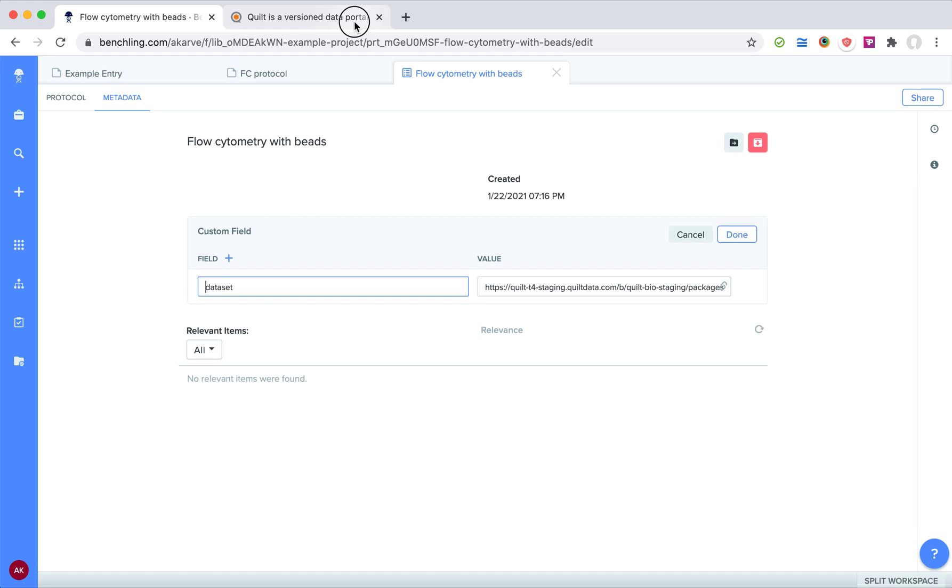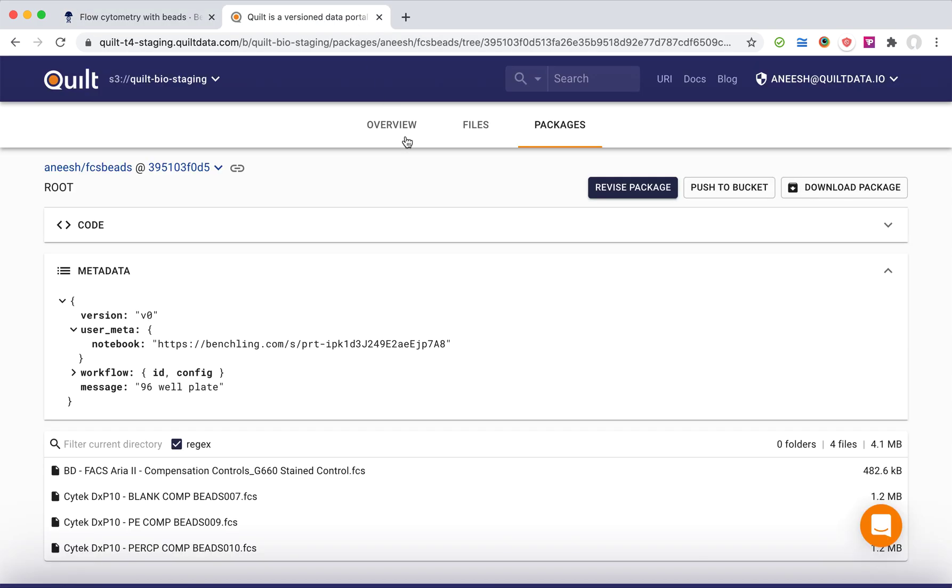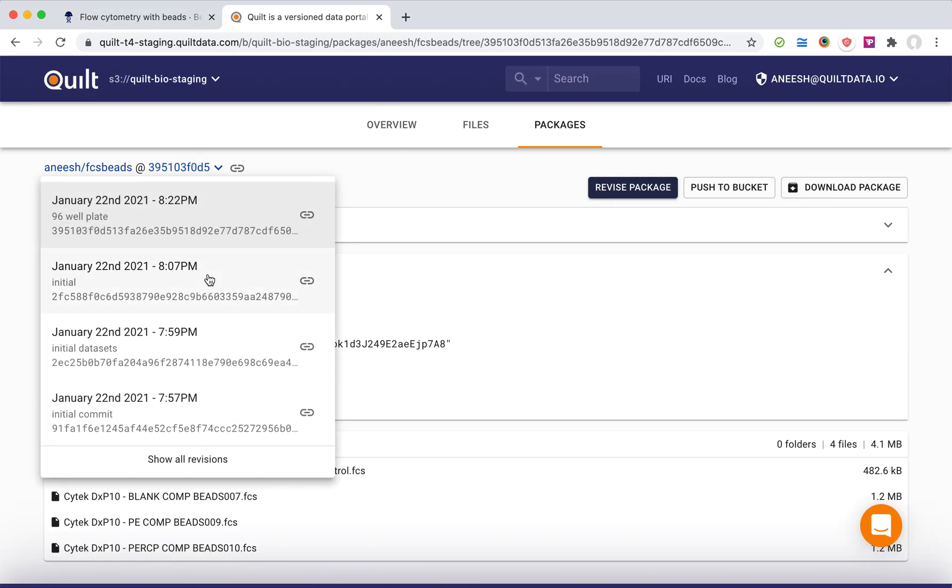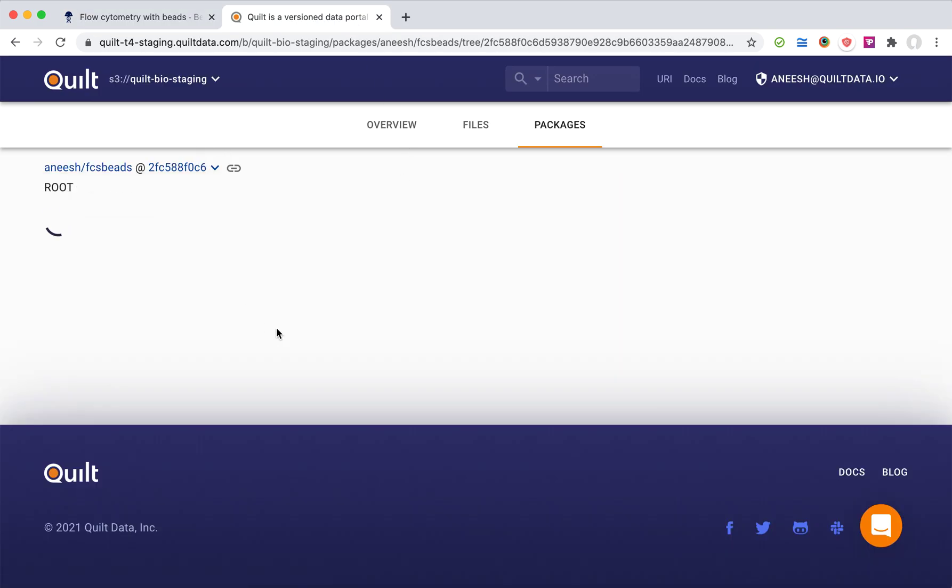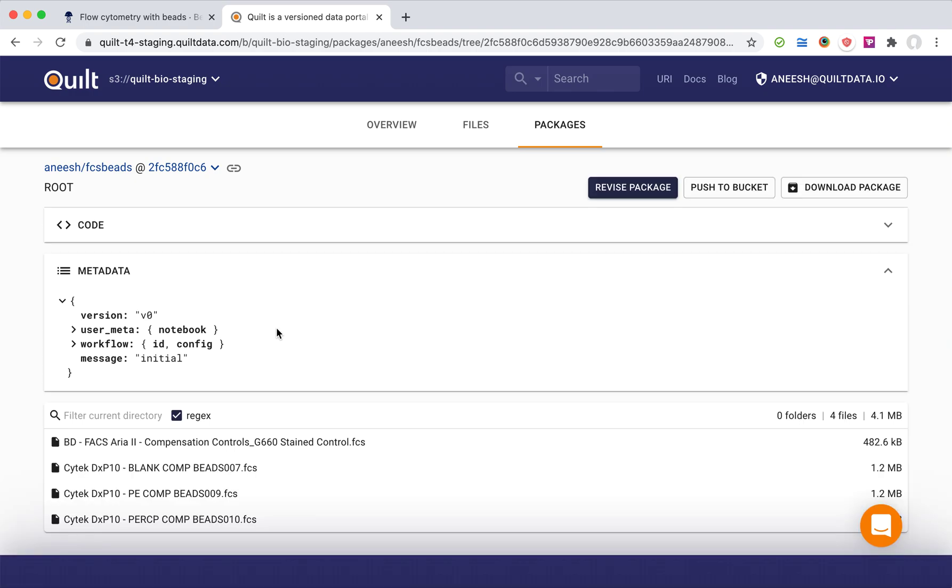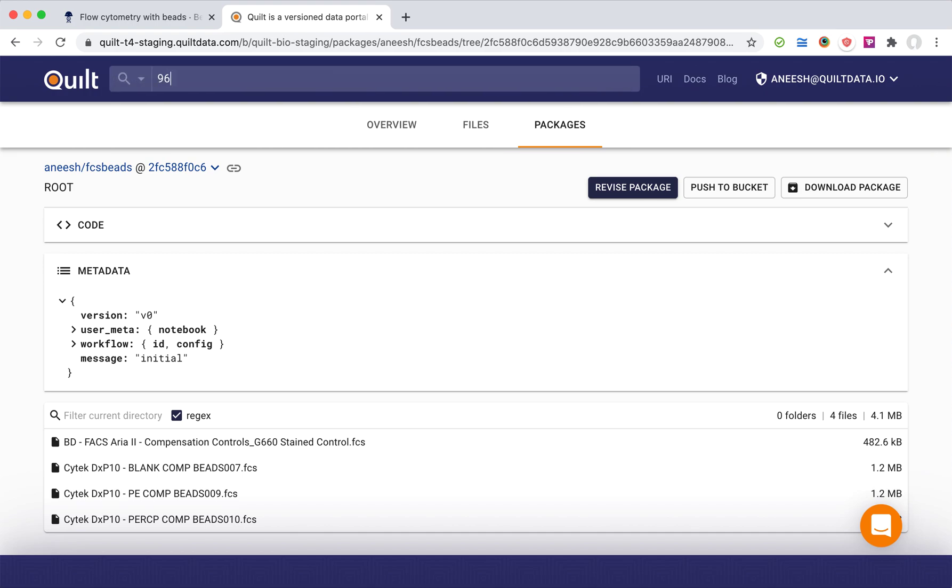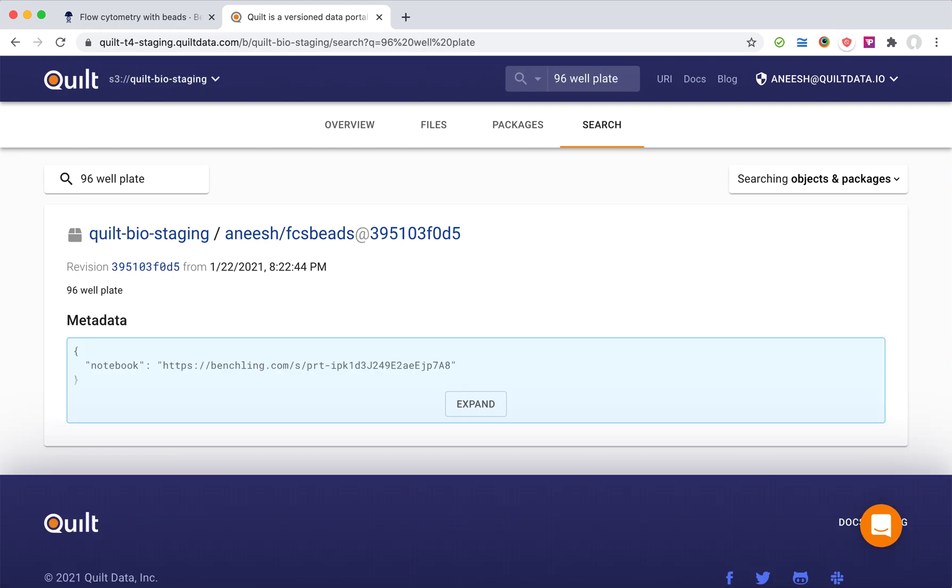Each of these revisions is a complete time capsule, so the data is what we call immutable—it can never change. Any colleague who wants to grab this data can first of all find it. So if I look for 96 well plate, which is my commit message, it's actually going to pull up the dataset that I created with that message.